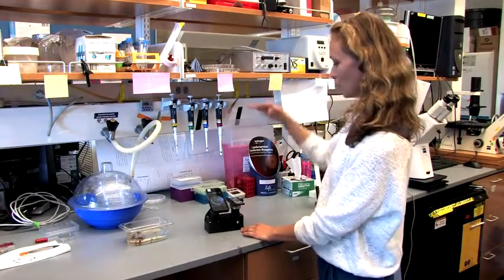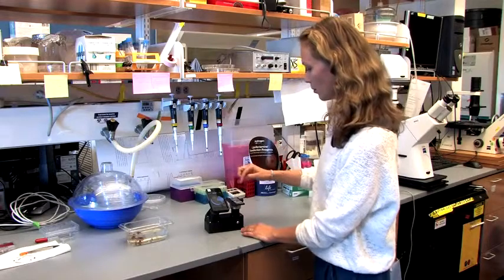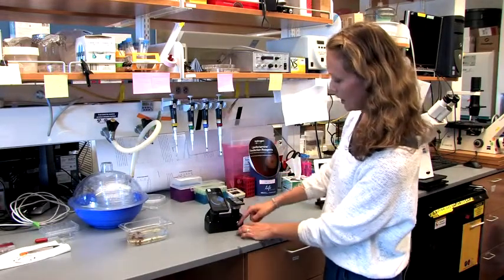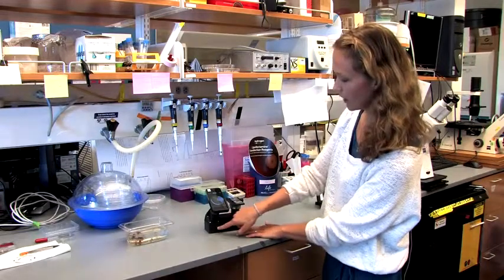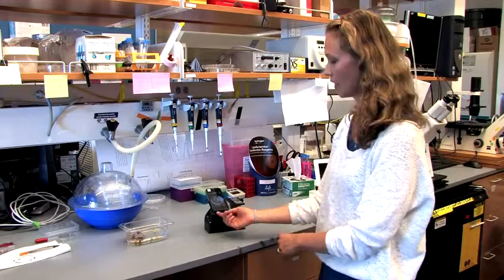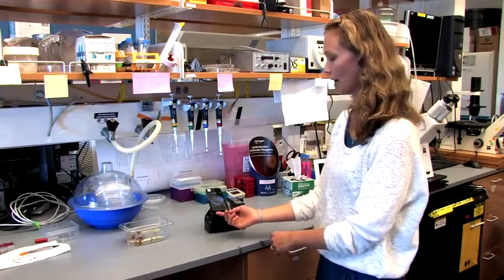And the light comes in just from the room lights in this case. It goes through the sample into the magnifying lens here. And the light goes then, it hits a mirror here and it hits another mirror on this side and is directed up through what's called an eyepiece and goes directly into the camera of the iPhone in this case.